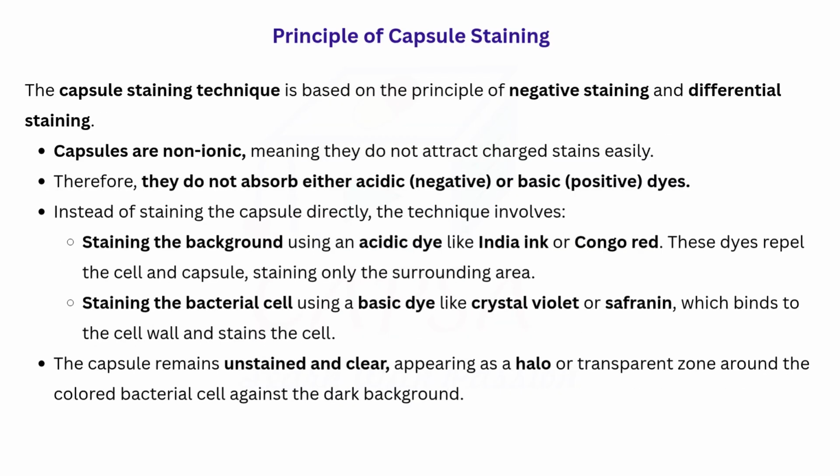Now let's understand the principle behind capsule staining. Unlike the bacterial cell wall, the capsule is non-ionic, meaning it does not attract or bind to most commonly used stains. So when we try to stain a bacterium with the traditional dyes, the capsule remains invisible.